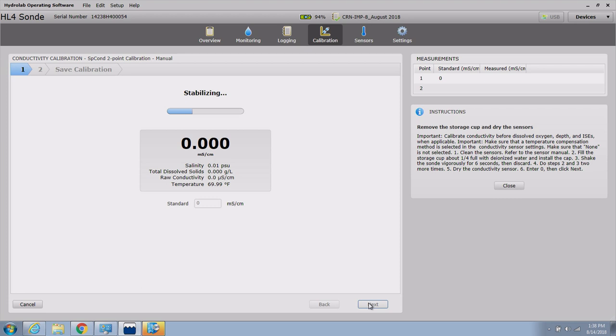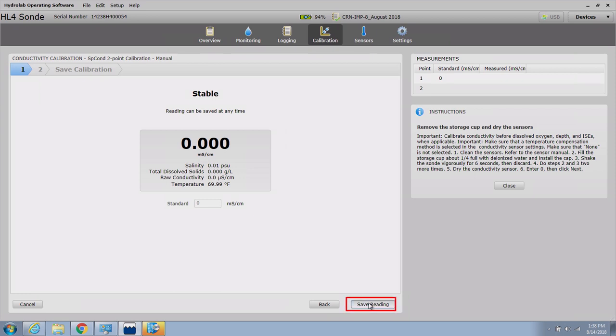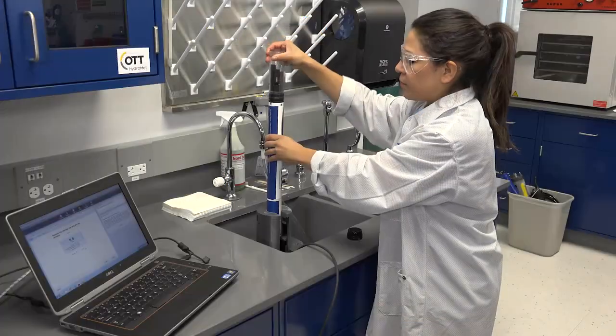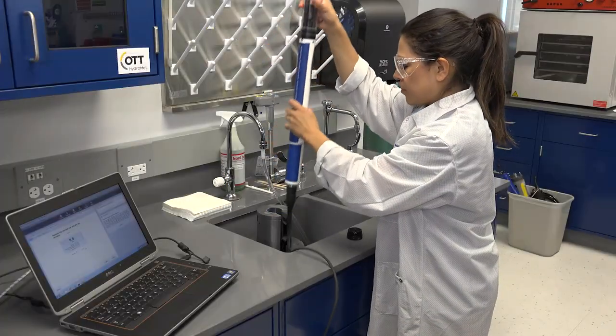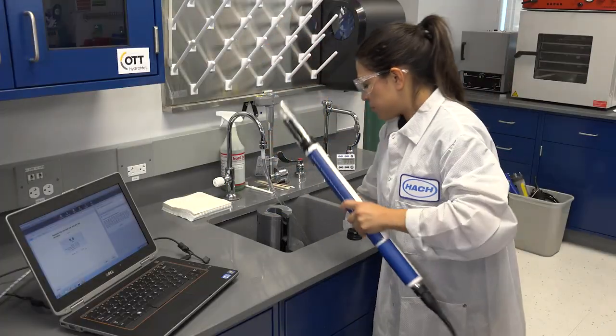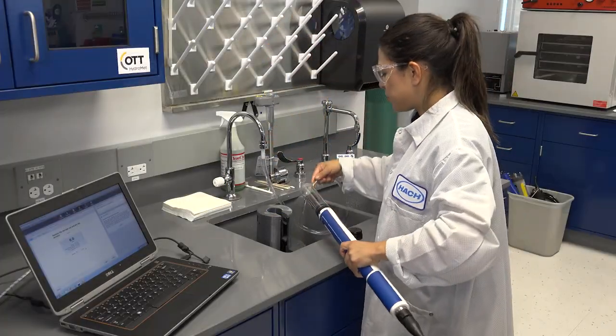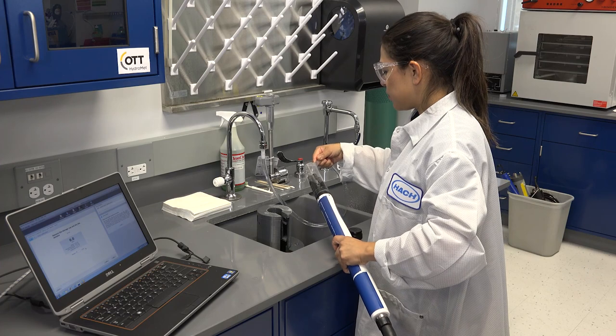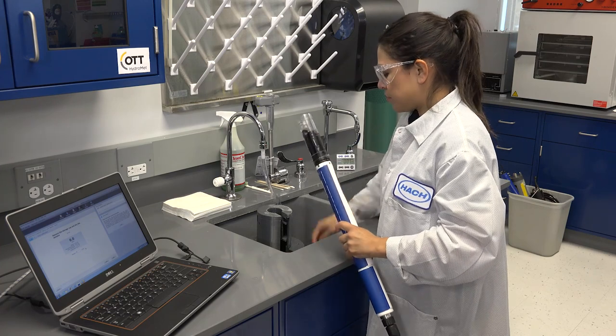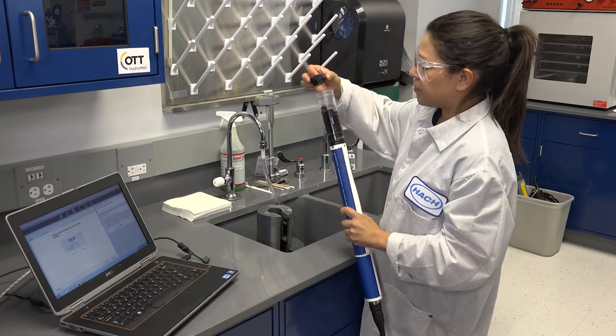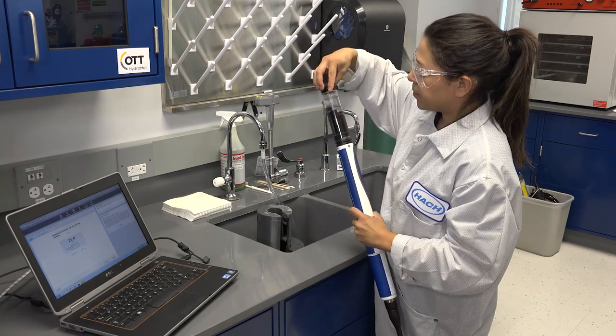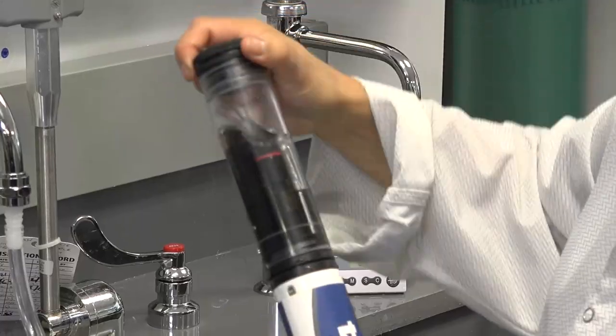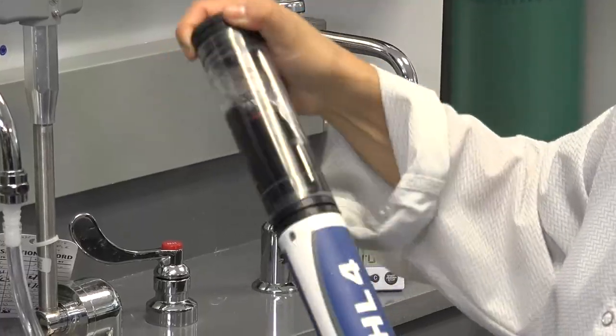To achieve the best results, the second calibration point should be higher than your expected conductivity value during the deployment. Rinse three times with deionized water by pouring a small amount of deionized water into the calibration cup, replacing the cap, and shaking vigorously for approximately six seconds.